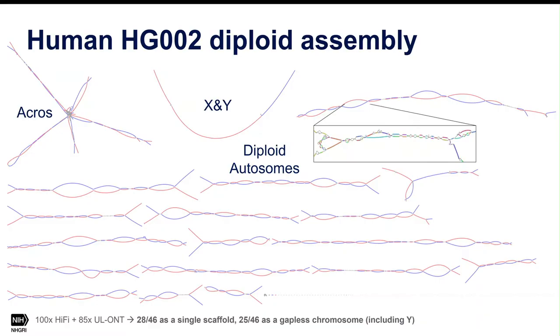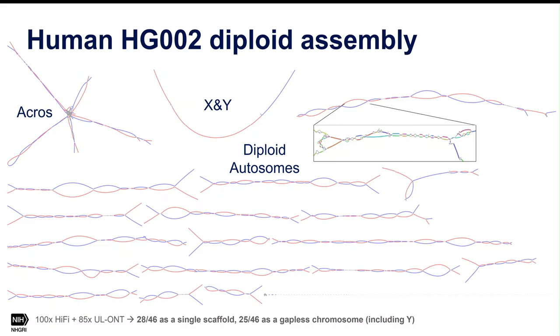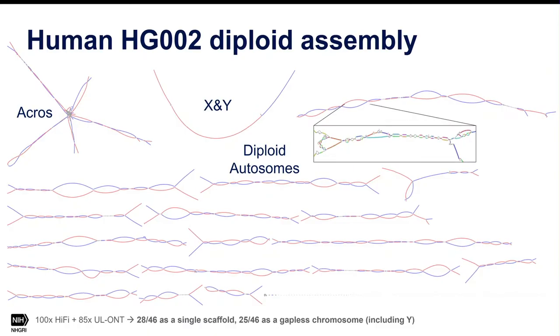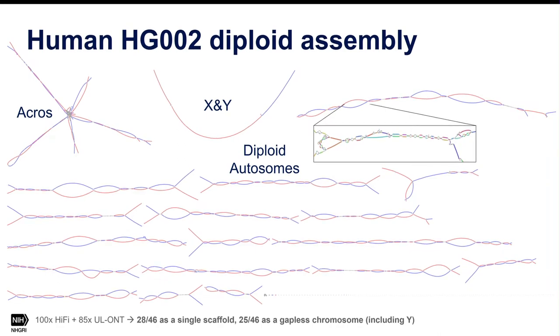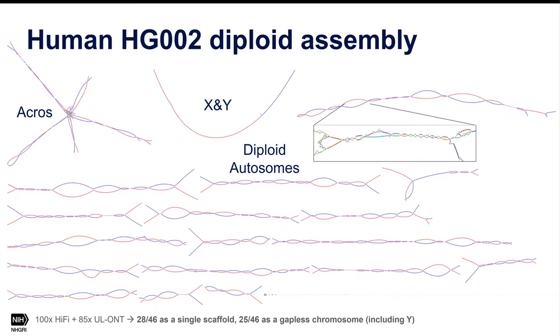So when they coalesce, that's a region that's homozygous, that means you inherited the same thing from the mom and the dad. And so it's 100% identical, so we can't separate it because all the sequence says that it's identical, right? And so it has twice as many reads as everywhere else, and so we see it as a collapse. And then the other regions where we saw differences in the HiFi graph, because it's a very high resolution map, right? We can see that there's like single bases different between the maternally inherited, paternally inherited sequence.